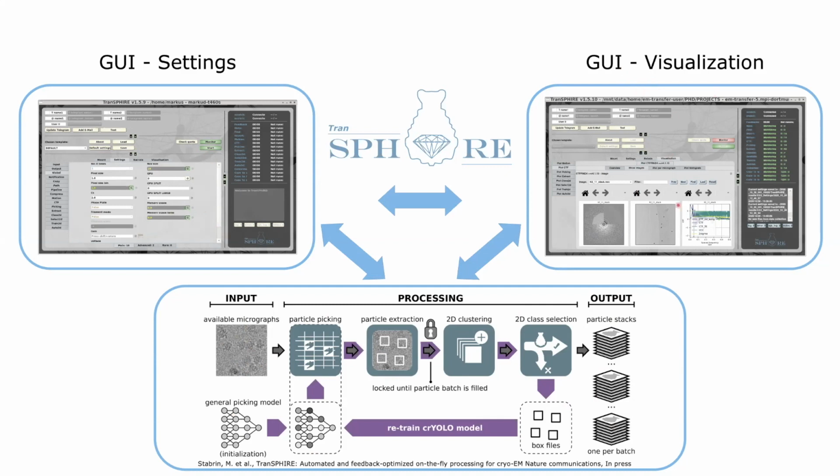That means every result that we get from every single step of the TranSPHIRE pipeline is visualized and can be assessed live on the fly during the data acquisition. So this allows us to identify possible problems of the data acquisition itself directly. Let me give you an example.